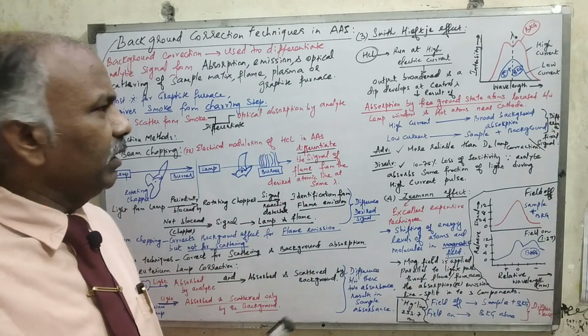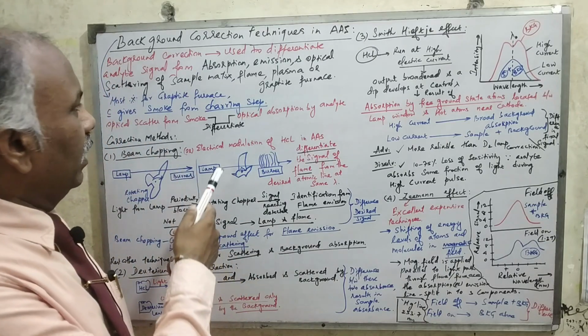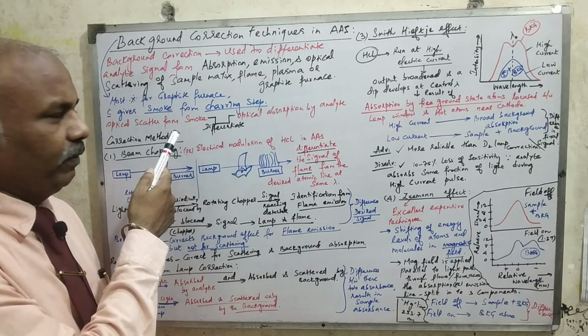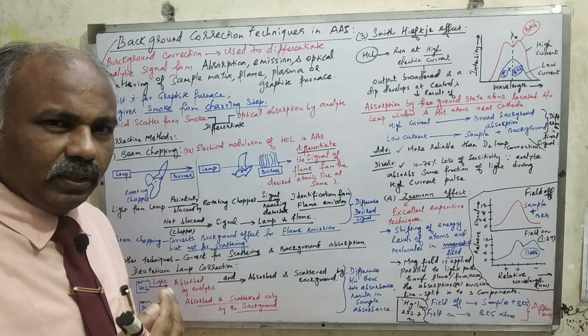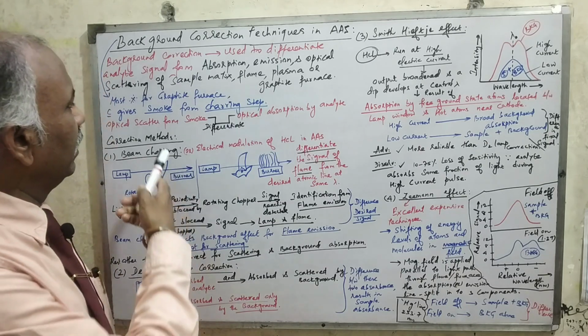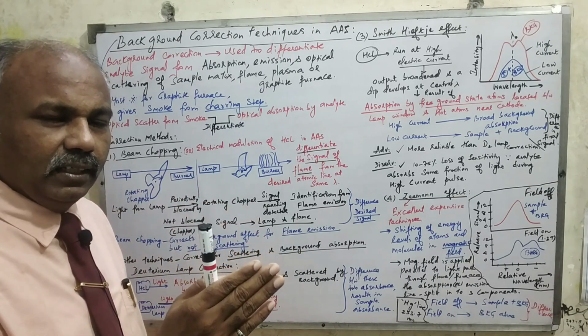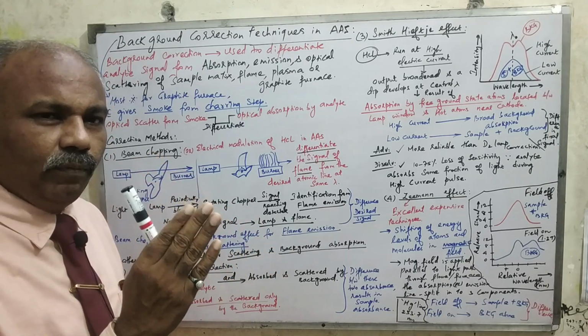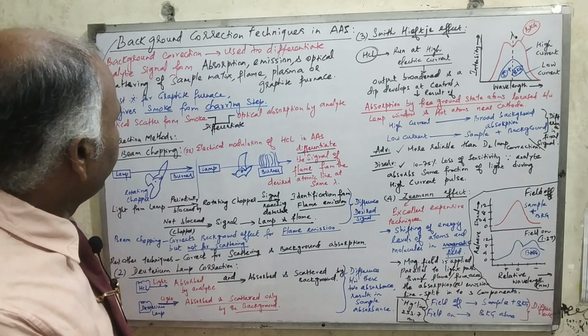Why is background correction most important for the graphite furnace? Because it gives smoke from the charring step. Smoke during the charring step, pyrolysis or decomposition from heat, will definitely be a bigger problem there, and that will always cause interference. So to avoid that, we should definitely go for rectifying this with background correction, right?